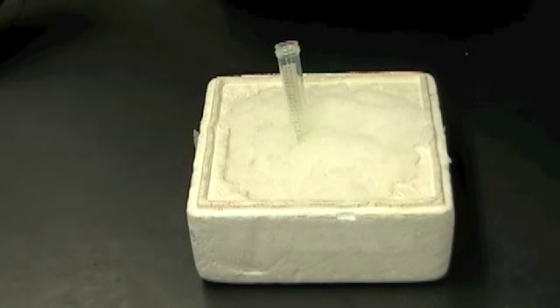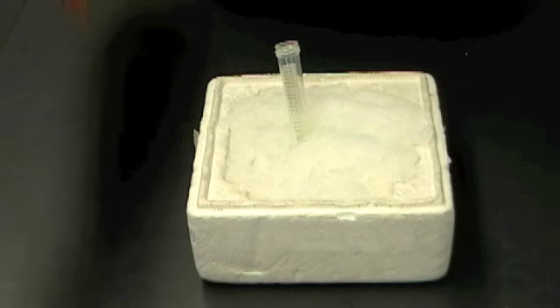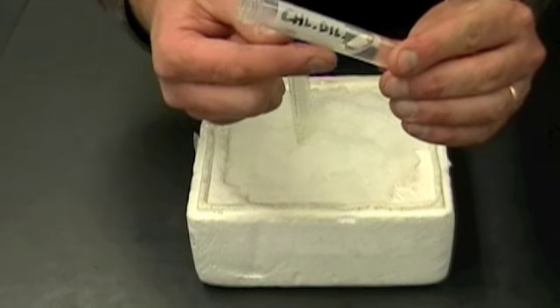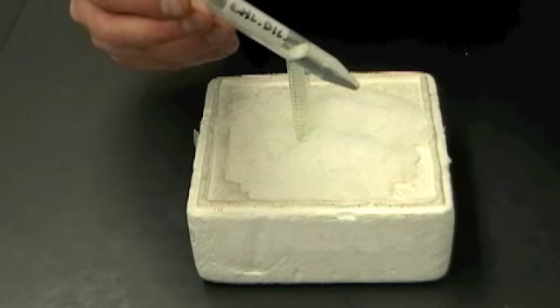So I compared all 3 of those solutions using a microscope, and I found out which one contained the highest number of free chloroplasts, and it was this one here. So now what I need to do is make one more solution. This is called my Chloroplast Dilution, and this is really important because this is what we're going to use in all of the subsequent steps of the experiment.